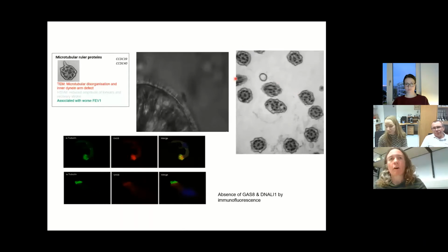And here's another example here. This video isn't working, but essentially you see some movement of the cilia by high-speed video microscopy. By immunofluorescence, you see an absence of GAS8, which is a marker for the nexin-dynein regulatory complex, and you also see an absence of DNALI1, which is a marker for the inner dynein arm.